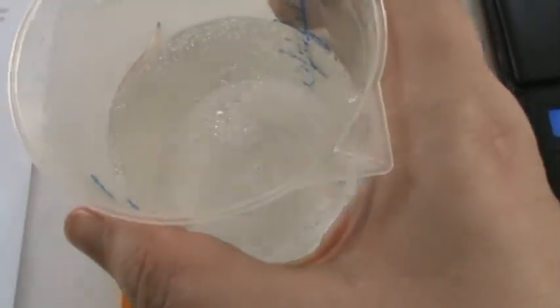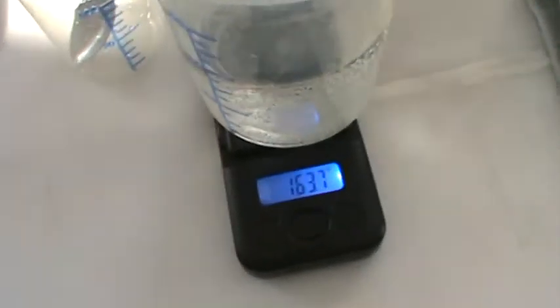The bubbles will eventually come out of solution, but sometimes it can take some time. Okay, let's see if the aggressive stirring that I was doing has made more of this evolve.